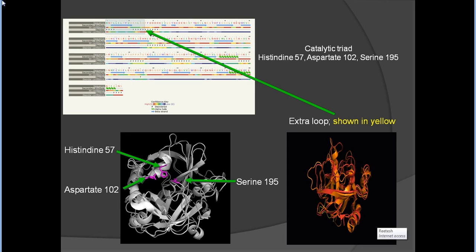Now I will describe how to make a video. First, set up the video by opening the PDB file, then use the text commands to set up the video roll. Rotate the molecules and save each frame in PNG format. After that, save all frames in PNG format.